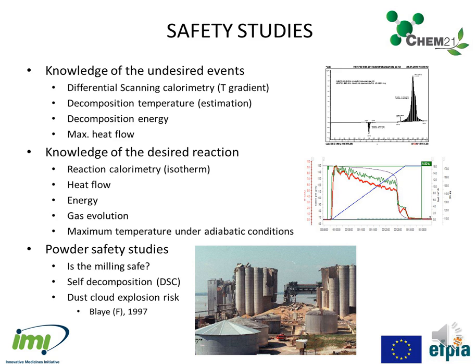The explosion of dust clouds may be catastrophic, like in Blaye near Bordeaux in 1997. Specific studies are conducted, especially if the product is milled or grinded. One measures the self-decomposition properties by DSC and the ability to ignite in air by specific techniques I will not detail here.